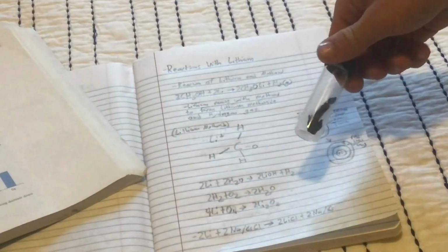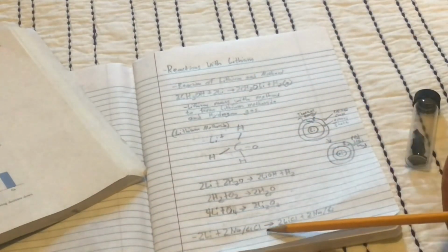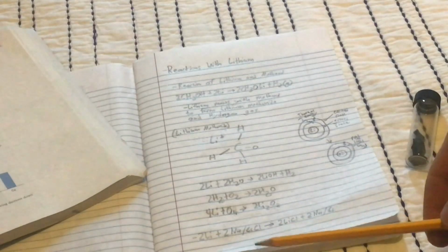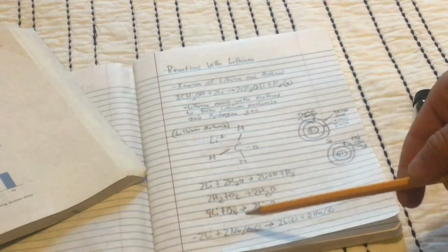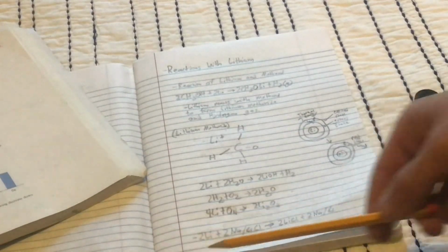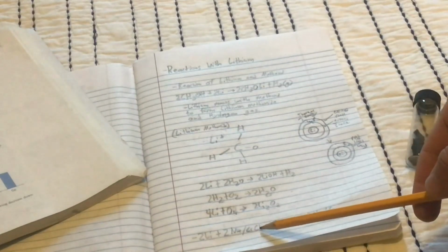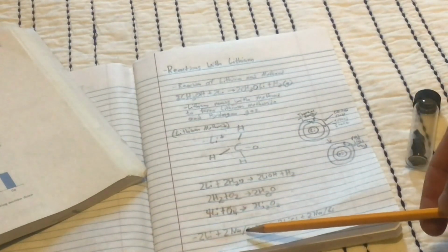Now, the last interesting thing we can do with lithium is actually react it with other salts, such as sodium chloride or cesium chloride. Now, to actually make this reaction happen, we have to drive it with a lot of thermal energy in something like a furnace. So when this reaction happens, the chlorine atom wanders away from the sodium or the cesium, and it bonds with lithium. And in turn, that generates sodium or cesium vapor.